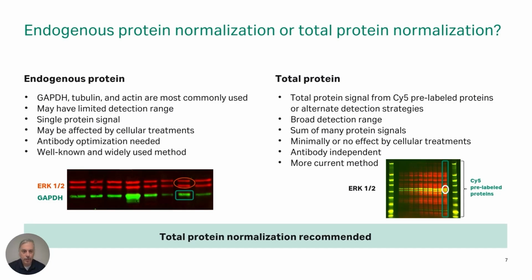You will still obviously need to optimize your antibody in terms of the dilution to recognize that protein target. But it is a very well known and widely used method, which a lot of people use to help overcome these problems with loading and transfer efficiency, as we said.